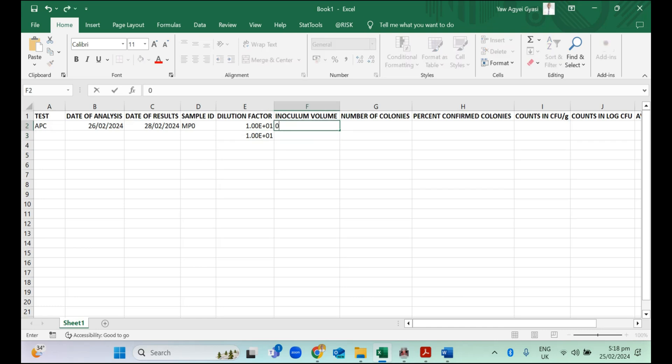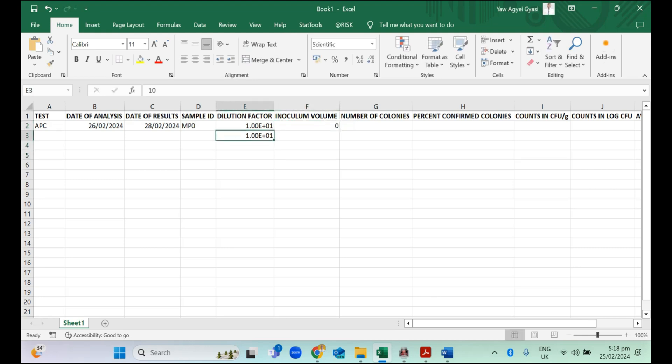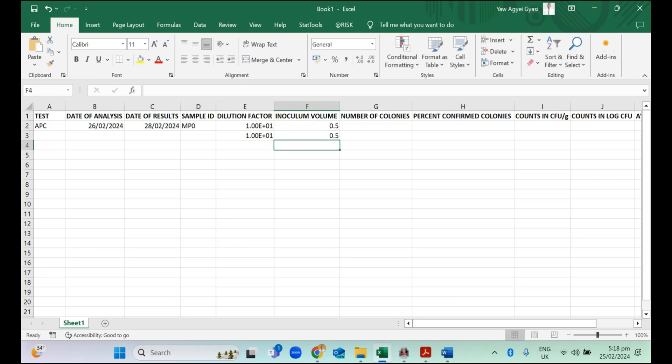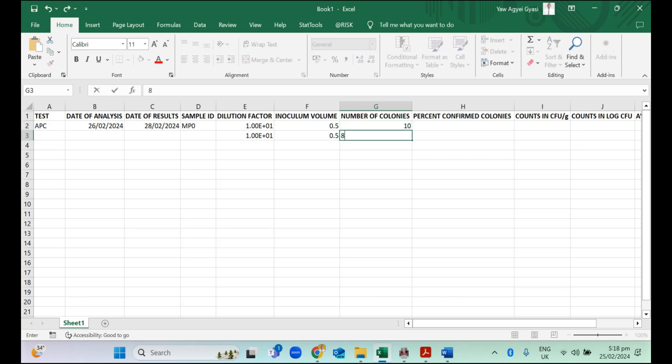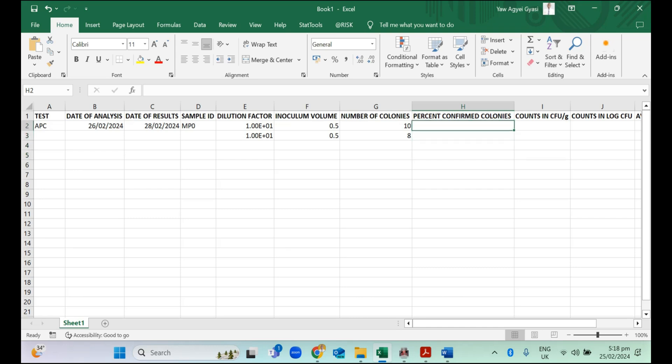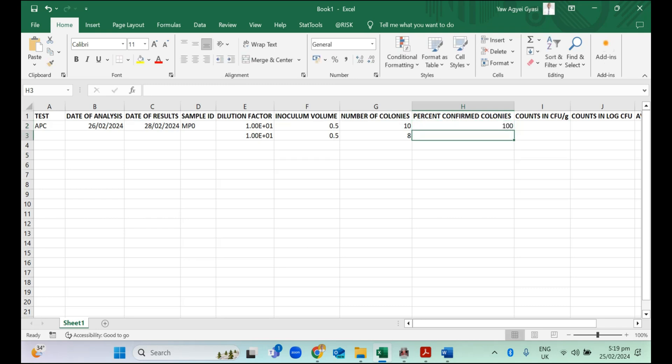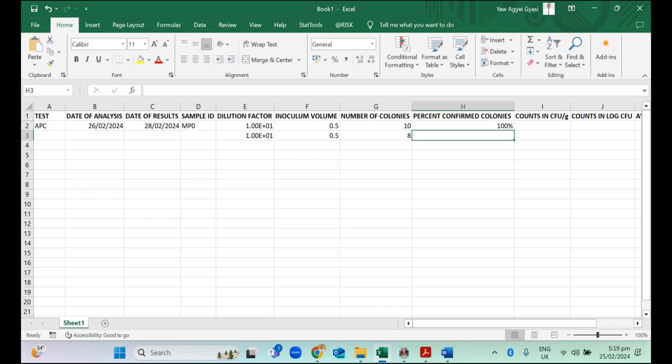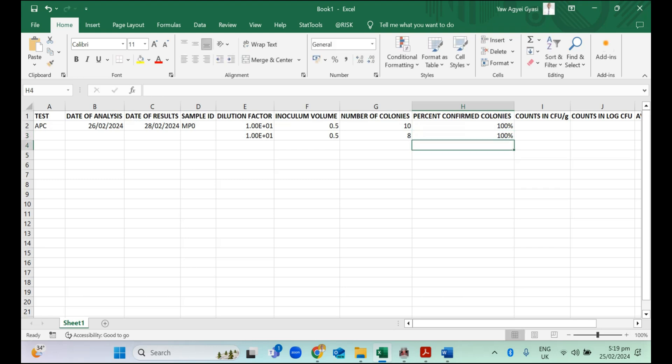The inoculum volume, supposing we had 0.5 as our inoculum volume, that is 500 microliters was pipetted onto the plate or on the dish. The number of colonies is 10 according to the data we are using. For aerobic plate counts, whatever grows on the plate is a bacterial colony. It's a count. We want to classify it as 100% confirmed colony at the percentage because of the formula we would be using.